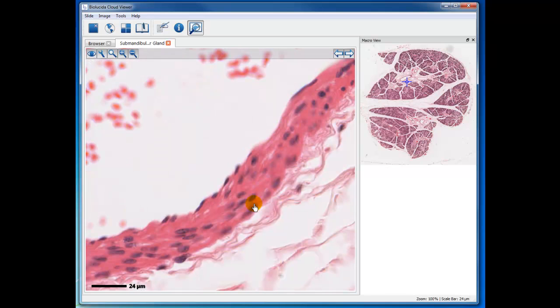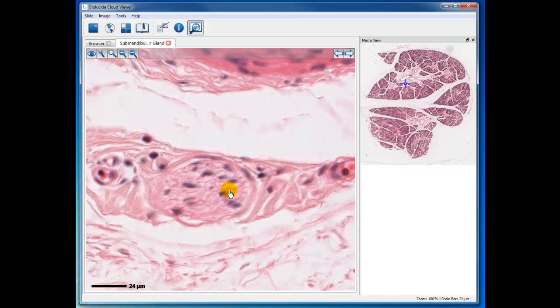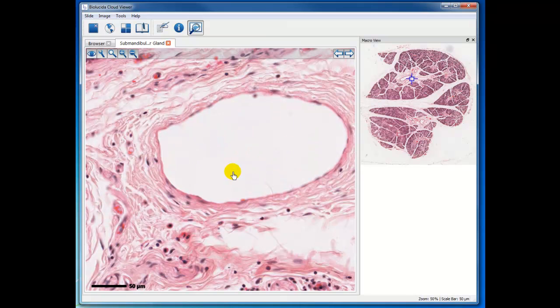And then here, you have to classify this as an arteriole. It's a fairly large arteriole, and it has less than 5 layers of smooth muscle around it. And then, while you're not histological experts, you might suggest or think that this is a nerve fascicle, and it is a very tiny one. Let's see, what else could I point out here? There are small veins here, and some of these may be lymphatics also.